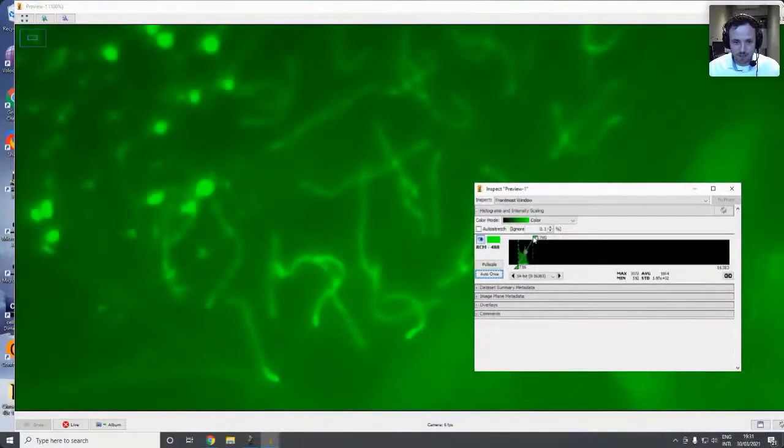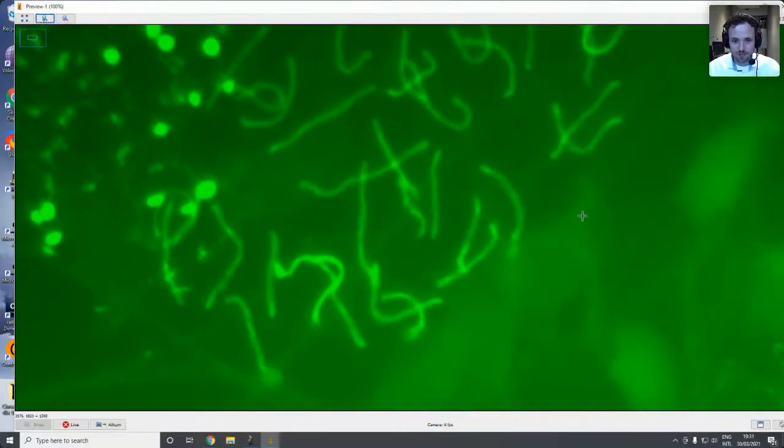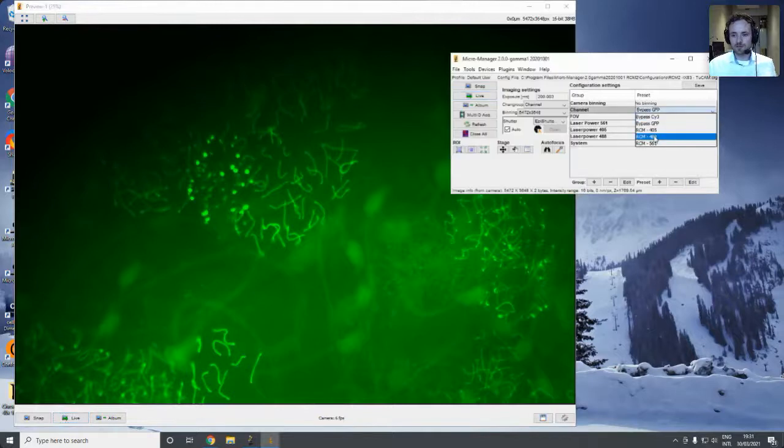Here you can see the well-known chromosome spread, or synaptonemal complex, which obviously is not resolvable in wide field. To get a good image, we would have to move into RCM. I can simply press snap image now. That should generate a high resolution RCM image.